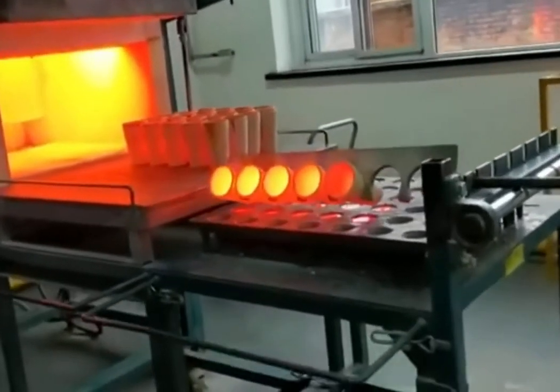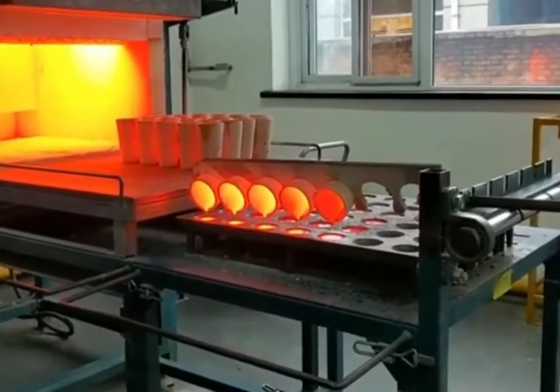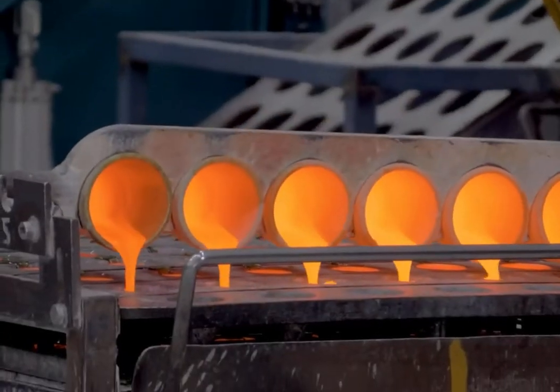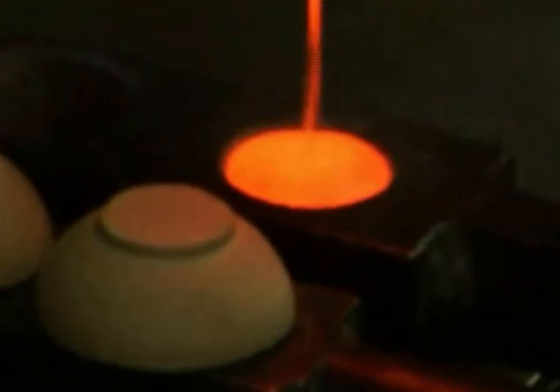The cupel is placed in a cupellation furnace and heated to a high temperature — around 1000°C to 1200°C — in a controlled, oxygen-rich atmosphere. Under these conditions, the lead in the molten metal reacts with any base metals present, forming lead oxide slag that is absorbed into the porous cupel.